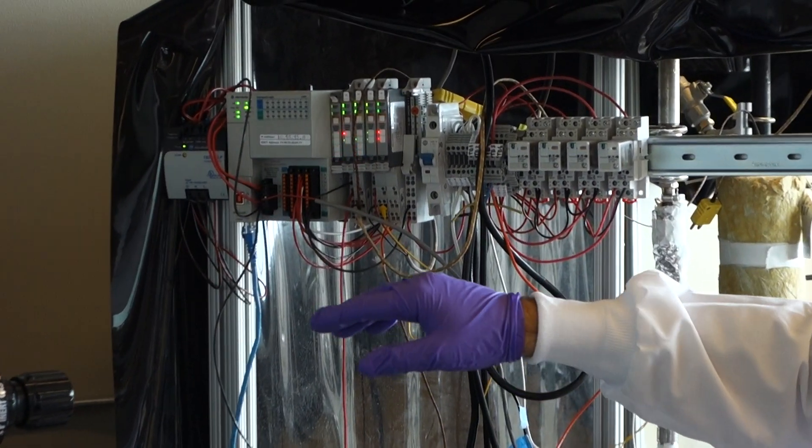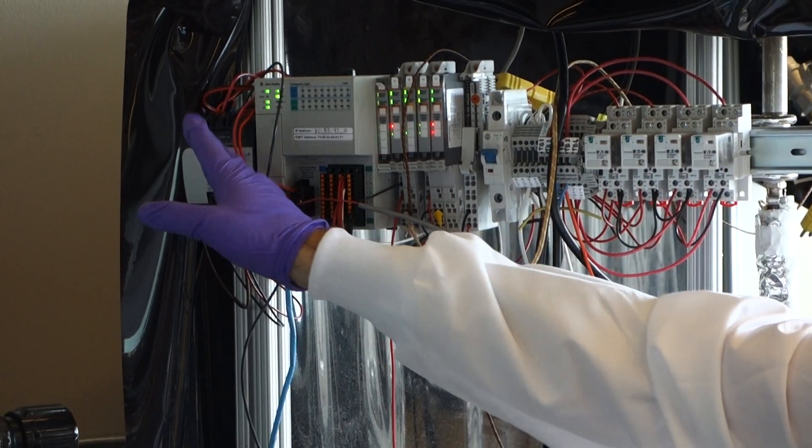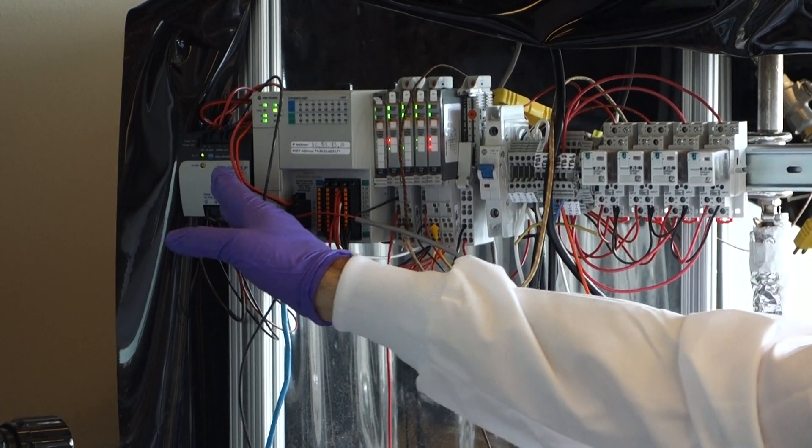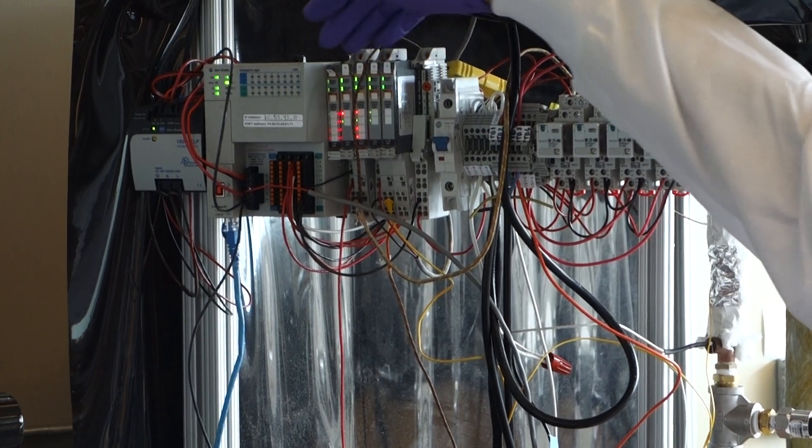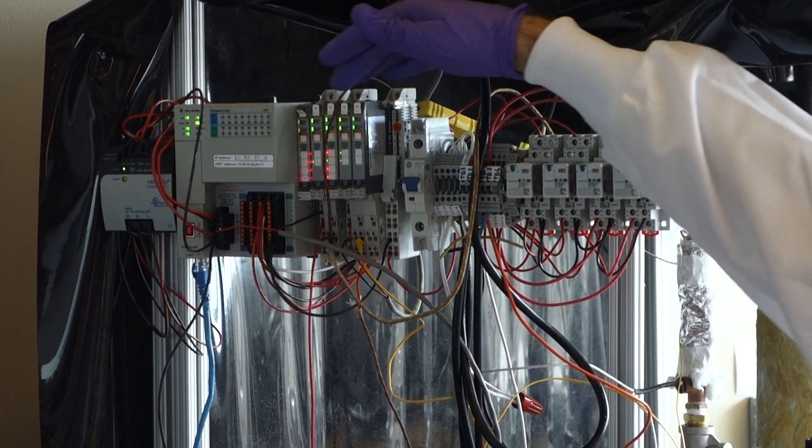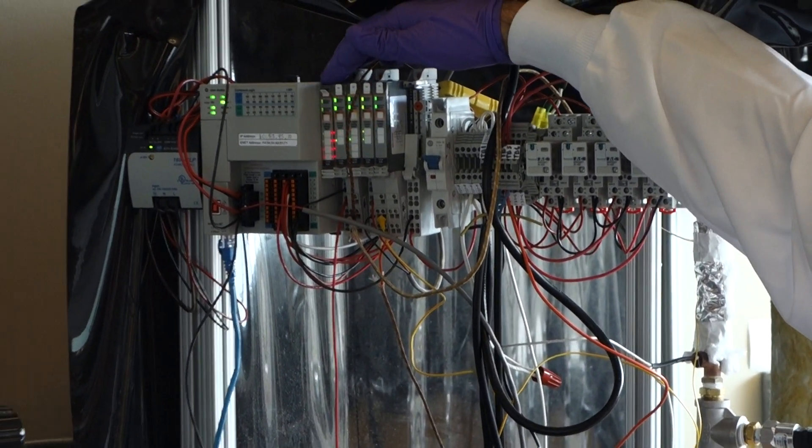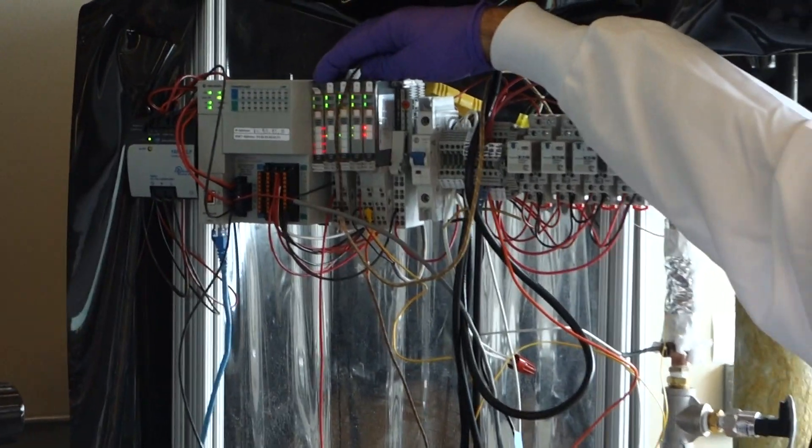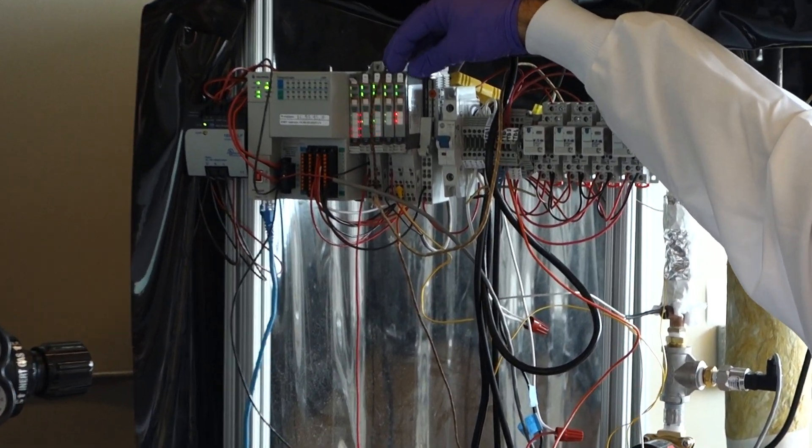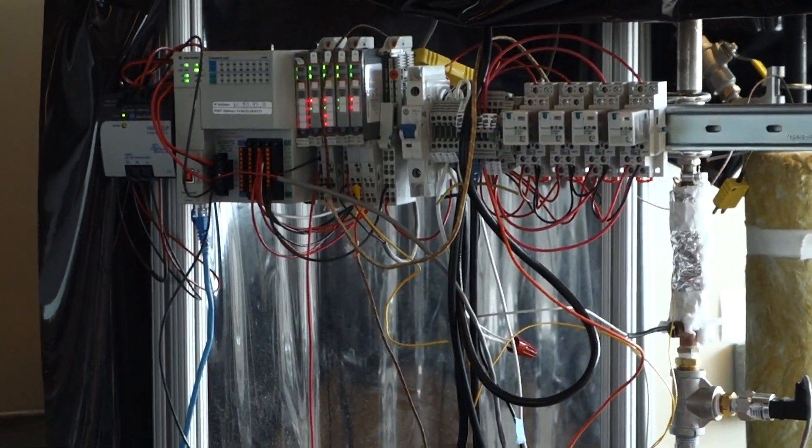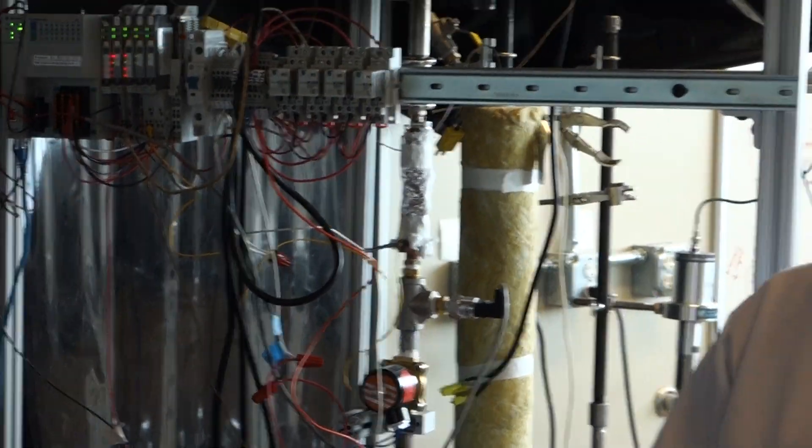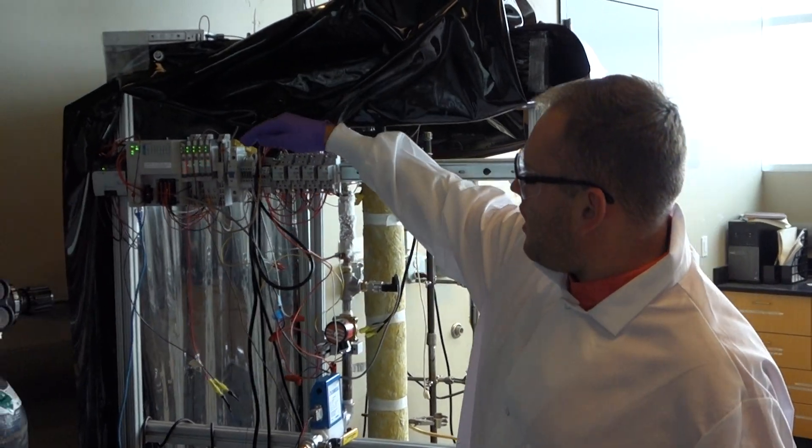Our programmable automation controller first starts with our power supply, our compact logics controller. We have several modules in which we can take in analog input, analog output, and we have three different cards that measure the temperature both internally and externally of our system.